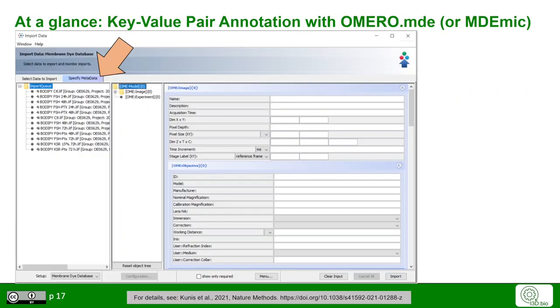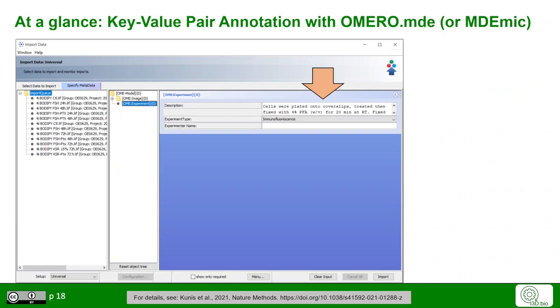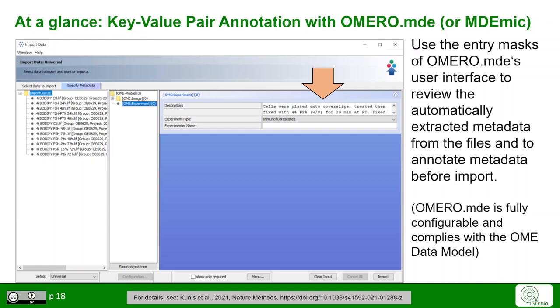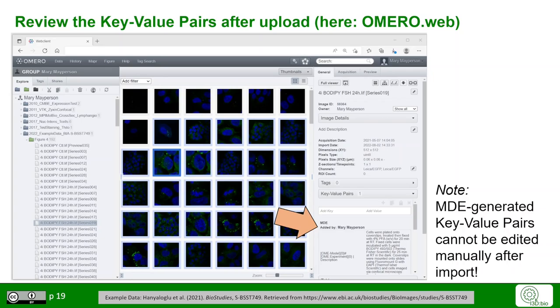Lastly, we focus on the OMERO MDE tool, which is part of the OMERO Importer client and used during upload. When you use the Specify Metadata tab in OMERO Insight during import, you can choose individual OME data model-based input fields, where some data is automatically populated. For example, the metadata field for the experiment contains a description and experiment type, and you can add the experimenter name. It also shows automatically extracted metadata from original files based on the Bioformats library. OMERO MDE is configurable and complies with the OME data model.